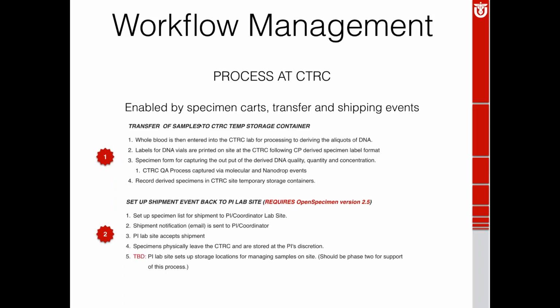It's in a virtual location somewhere else, and it's gone because they're not using OpenSpecimen in their lab. Let's say they're using another commercial package. It's outside of the Health Sciences Center, or they're just another lab that wants to continue using their current process. So that's essentially the workflow.